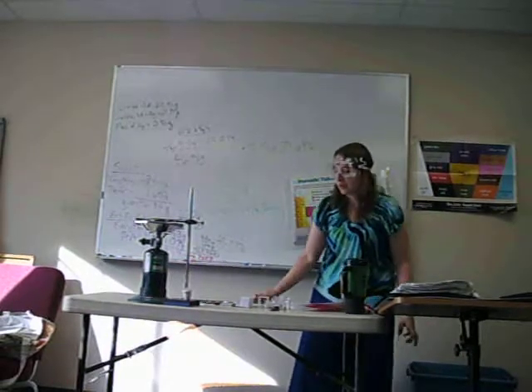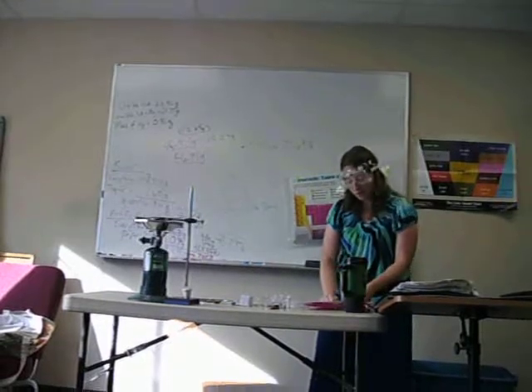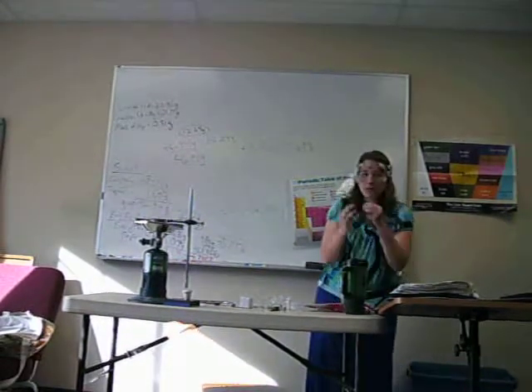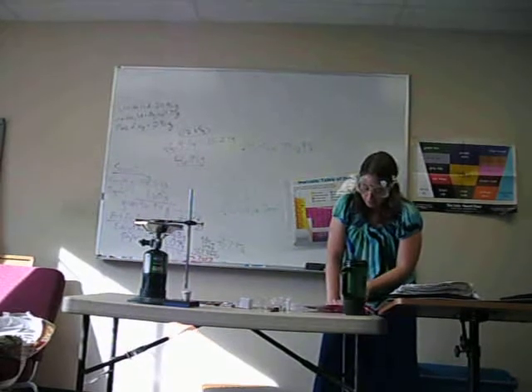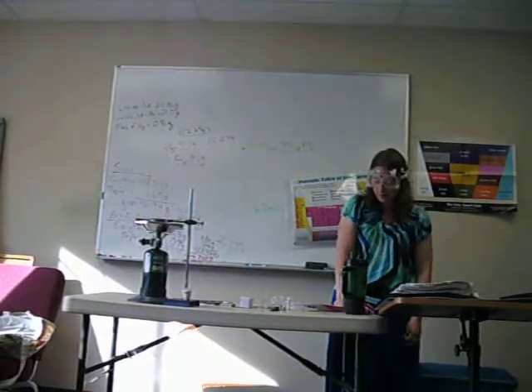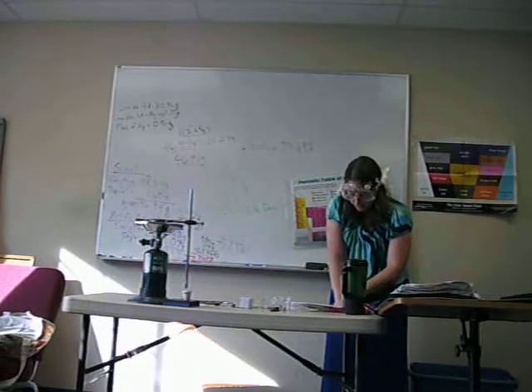Hopefully I heated it long enough and added enough oxygen by fanning it to get it all to react, but chances are good that some of it got surrounded by magnesium oxide and some of the metal didn't get oxygen to react with. So that happened. We can poke through it after we weigh it and see how much we think that happened. But we have to get it smashed first before we spill any.